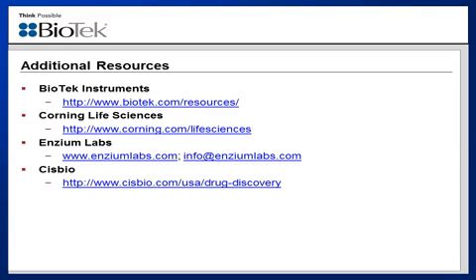The next question is, how deep can the microscope image inside of the tumor spheroid? That's a good question, and as I mentioned previously, this is a wide field type of microscopy.